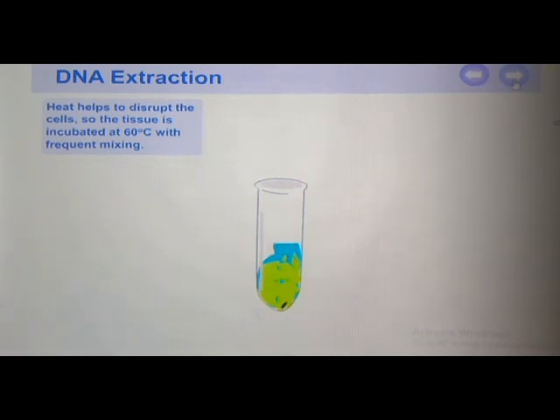Heat helps to disrupt the cells, so the tissue is incubated at 60 degrees centigrade with frequent mixing.